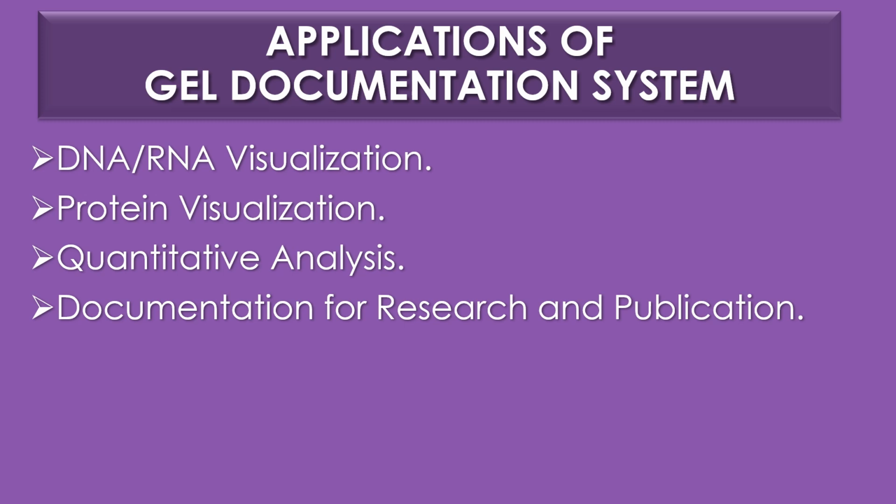The second application is protein visualization. In proteomics, gel doc systems are used to document the protein bands which are separated by SDS-PAGE, isoelectric focusing or two-dimensional gel electrophoresis. The third application is quantitative analysis.